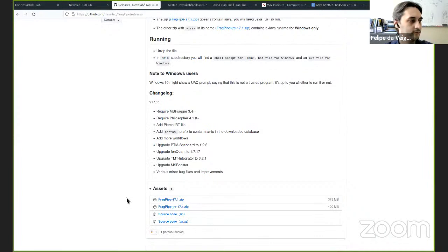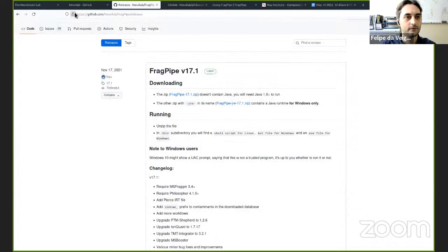So now I'm assuming that everyone already has the program on their computers. You don't necessarily need to follow the hands-on right now. This is going to be recorded and broadcasted later, so you can just watch the presentation now. And if you want, you can try to follow up what you're doing later. Okay.